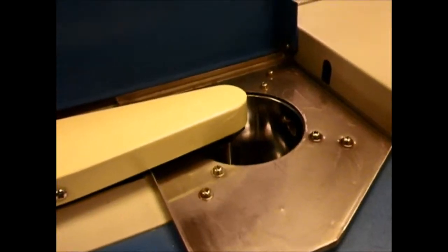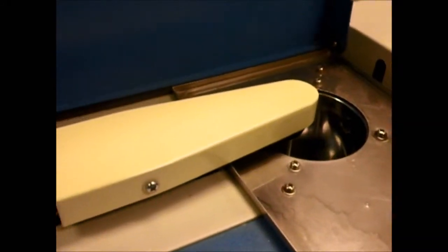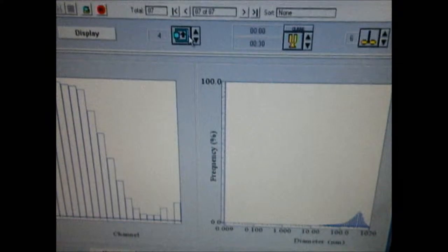You may want to pour liquid through for a couple of seconds if you've already done a run. To fill the circulation bath, simply pour liquid into it — you want to fill it up to about the three-quarter mark. Then on the computer, start what is called the Circulation — that's this button right here.